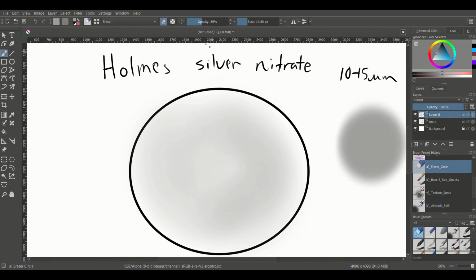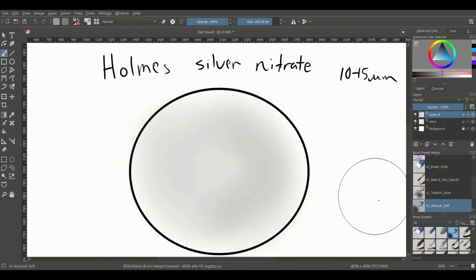So that's something to keep in mind: with any kind of silver method, you've got to make sure you clean that glassware with some sort of acid. Nitric acid, or sometimes sulfuric or hydrochloric, can be enough to clean that up for you. But right now, at this point, we have just a little bit of gray there, maybe. Hopefully not too much. Then after that, we're going to wash that off to get the excess off, and then put it into our impregnating solution.